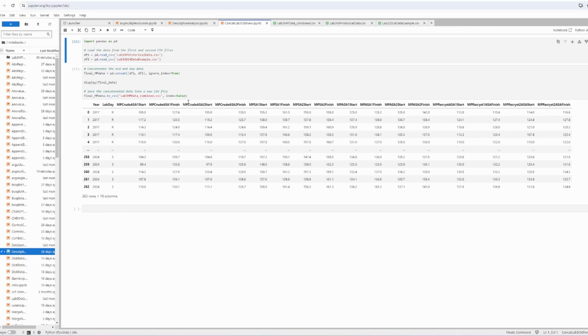So we're trying to combine all of these data sets here, average out every one of the 1 and 2 column headings, and create a new column heading based off of these. Right now we're at 18 columns, and we're looking to increase that, unfortunately, but we are going to work on the average data set for our analysis.